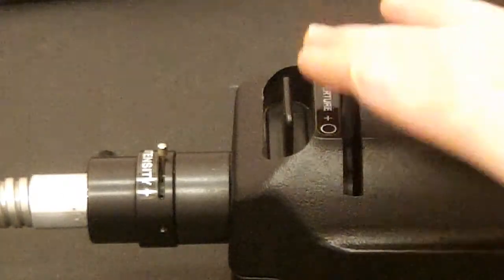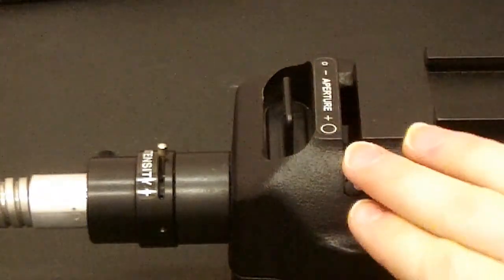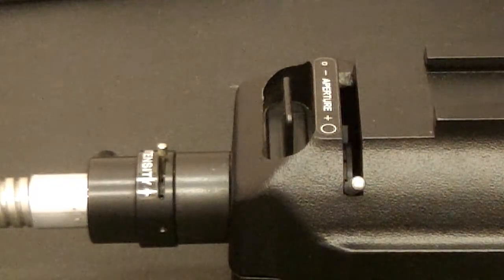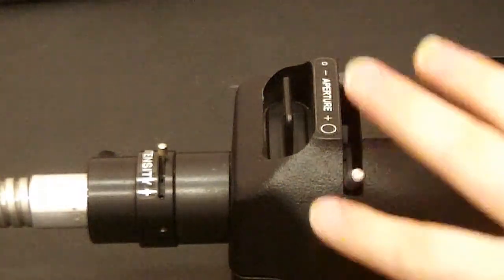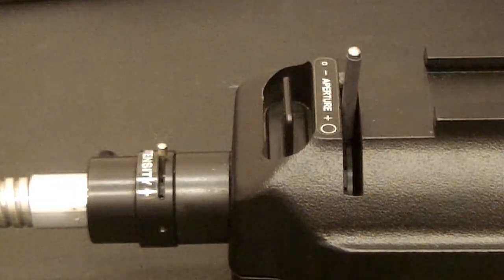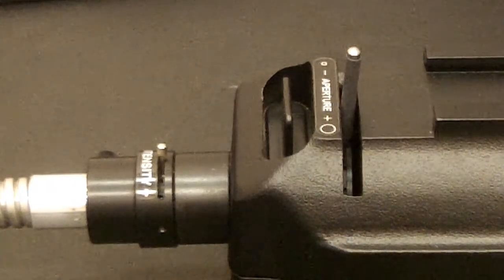And then next to the light filter is an aperture control. Closer to you, the aperture is more open, which means there's a wider area for light to go through to hit the specimen. And as you move the dial farther away, like intensity, the light will go through a narrower diameter.